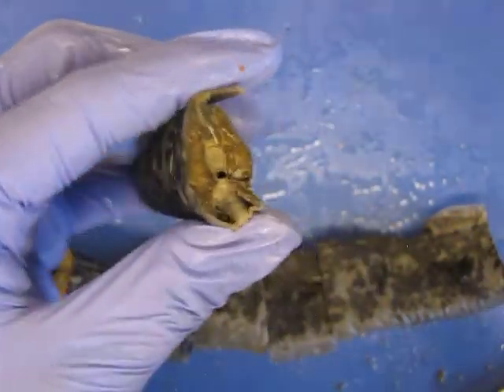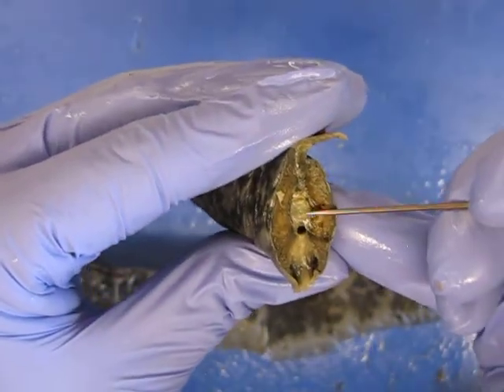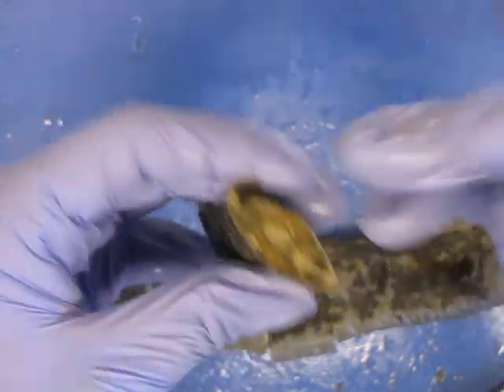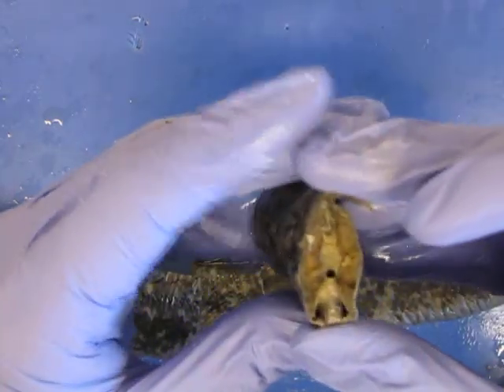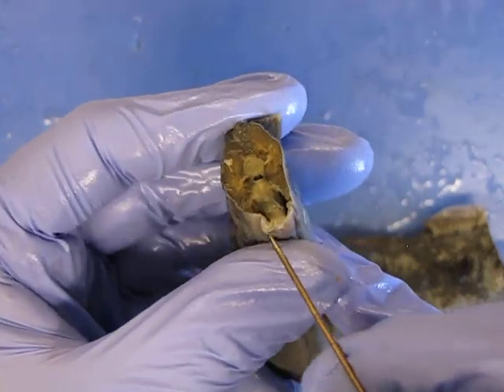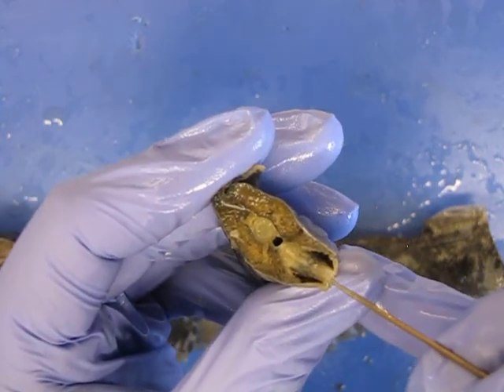Here on this, I just turned that same one over. So kidney, archonephric duct, turn that over. Orient yourself again here. Notochord. Spinal cord area is getting much smaller at that point, as is the hematopoietic tissue. It's disappearing onto the tail because this is the cloaca here. So now this end over here would be tail. This is body. Right here is the actual cloaca itself. You see that there. Here's the little projection. That is the papillae, and it's coming out the cloaca because this is where the archonephric duct drains into.